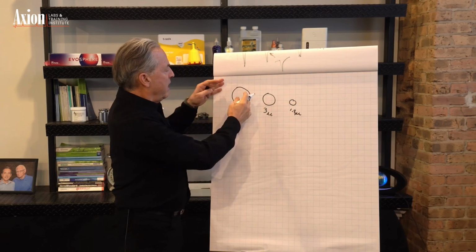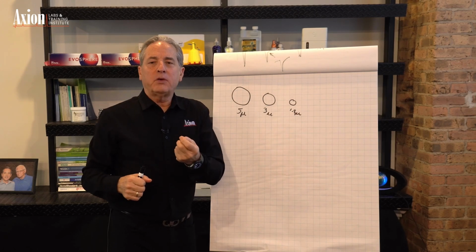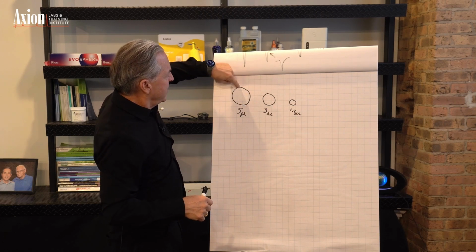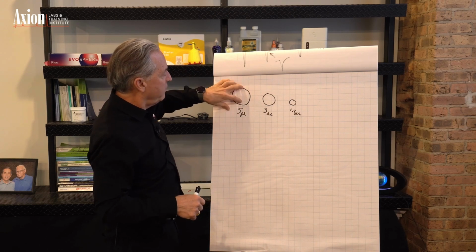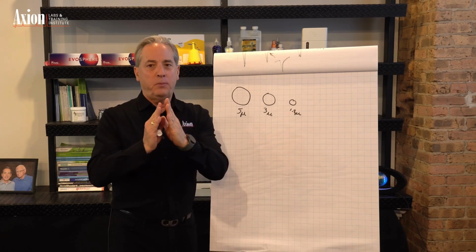the smaller the diffusion path, the less difference there is in molecules. So I have a billion molecules, a billion benzene molecules. I want them all to do the same thing. But when they go into a 5 micron particle, they can go in 1 micron and come back out, or 2 and come back out, or 3, or 4, or 5. So the molecules have a lot of choices. The more choices they have, the more different things they do, the broader the peak gets.